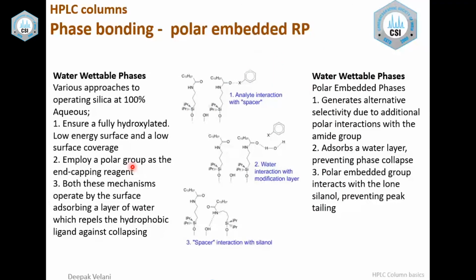Second, one more evolution which is happening in the phases is water compatibility. This is where, when we take absolutely pure C18 phases and we use more water, maybe 85% or more, the C18 phases collapse. What I will say is that if this is the phase, it falls because the water is polar and the phases are non-polar. So what happens is that the chain falls from the bonding phase and it loses its activity with the components, and that's how we call it phase collapse. So nowadays, polar end capping, or embedding a polar component into the non-polar chain, gives better water compatibility and at the same time better polar separations.